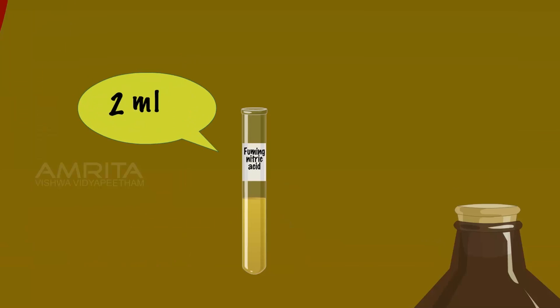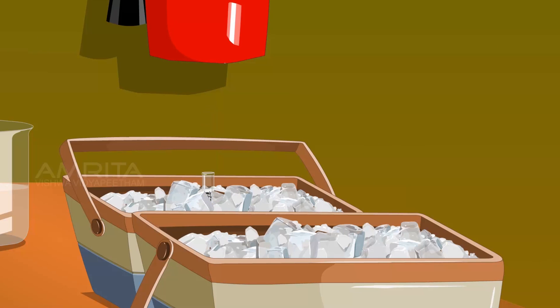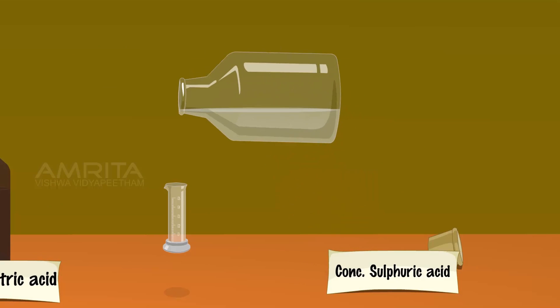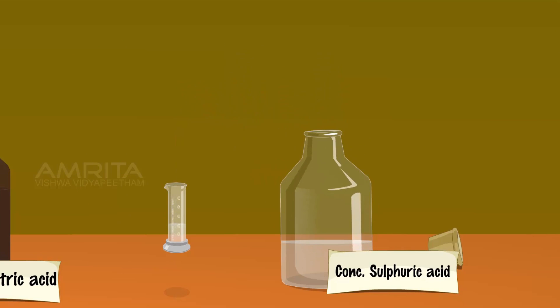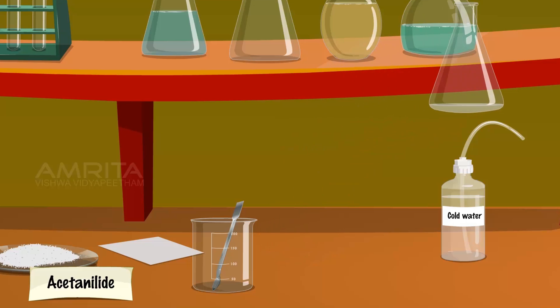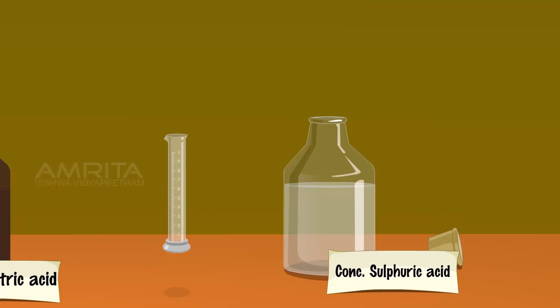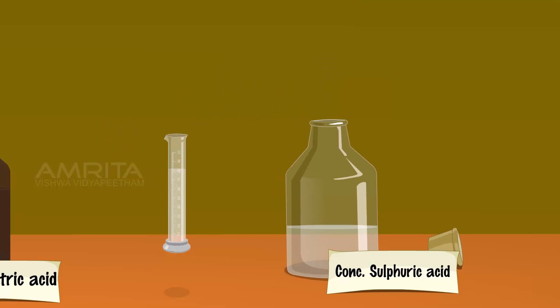Take 2 ml of fuming nitric acid in a test tube and cool it in a freezing mixture. Take 2 ml of concentrated sulphuric acid in a measuring jar and using a dropper, carefully add this into the test tube containing fuming nitric acid while stirring constantly. Take the conical flask containing the mixture of acetanilide and acetic acid, place it in a water bath, then add 8 ml of concentrated sulphuric acid to the conical flask using a dropper.